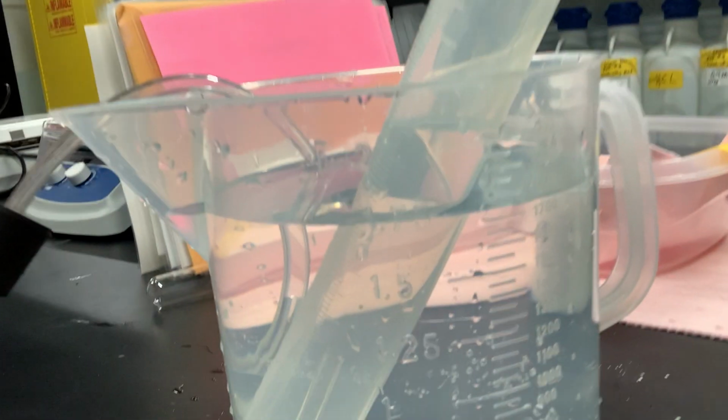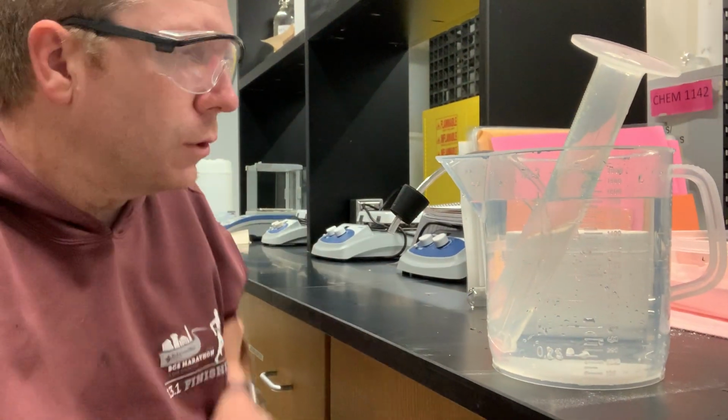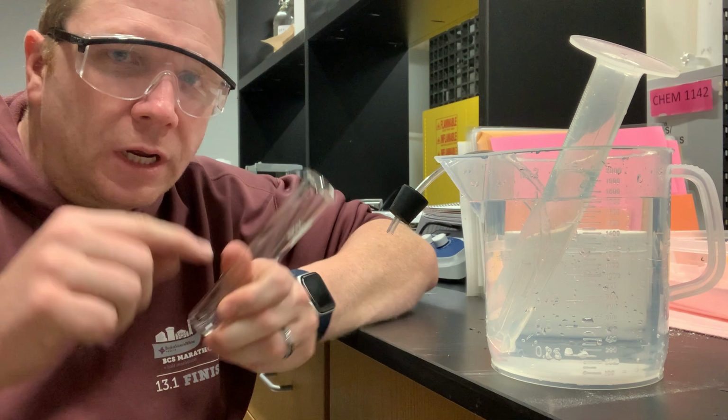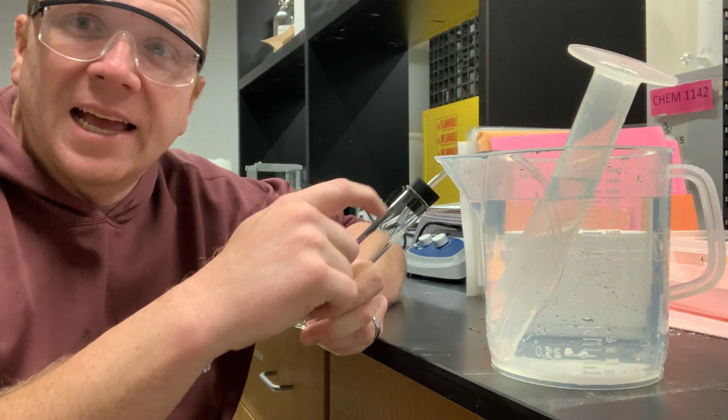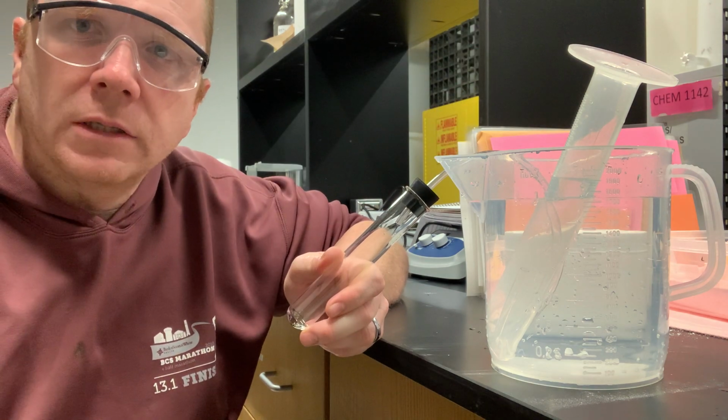Now you can look closely and see that indeed the tubing is in the grad cylinder, and now what I can do is have my reaction take place in here and very carefully and easily put the cap on. So any gas that is evolved goes into my grad cylinder.